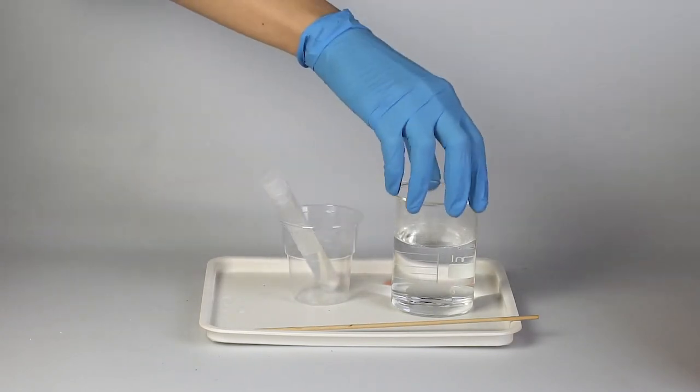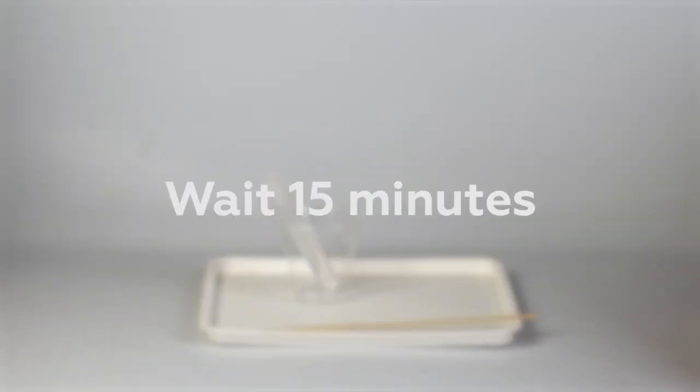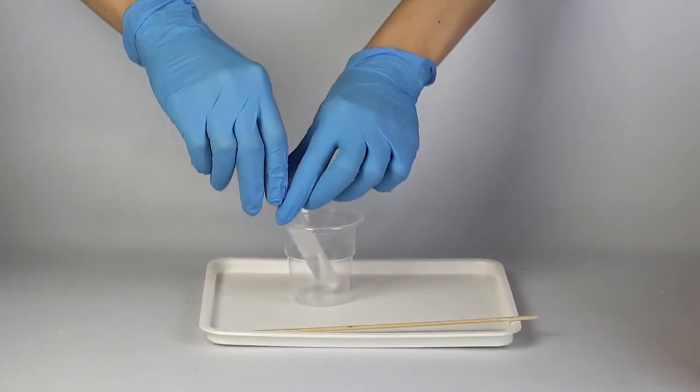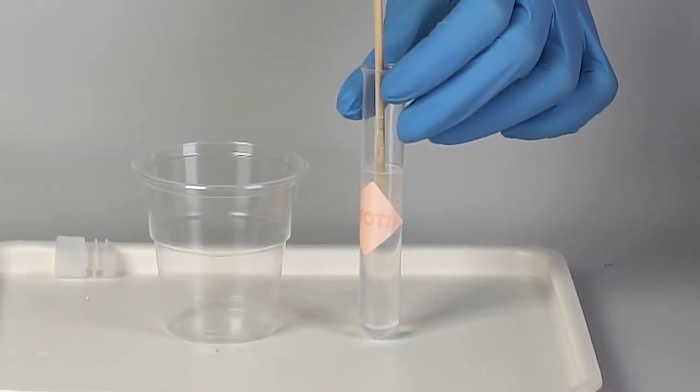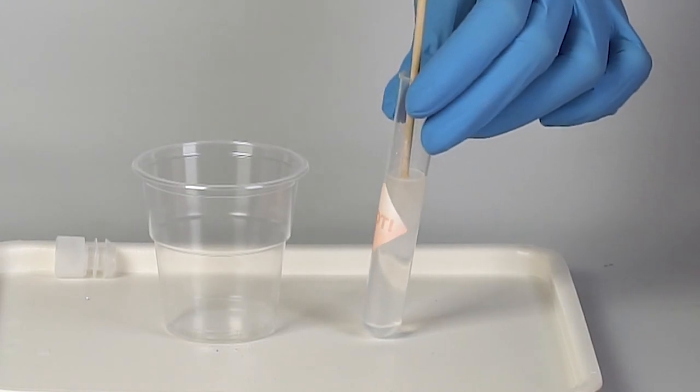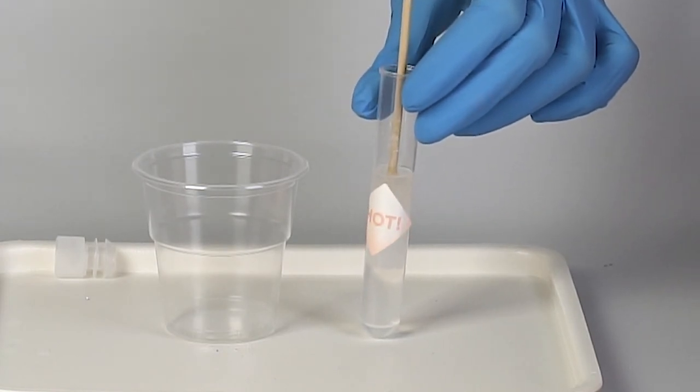Now, open the test tube and touch the solution with the tip of the splint. Since the test tube has cooled down, the sodium acetate will almost instantly crystallize, forming needles that look like snowflakes. You will notice this process produces enough heat to change the color of the thermosticker.